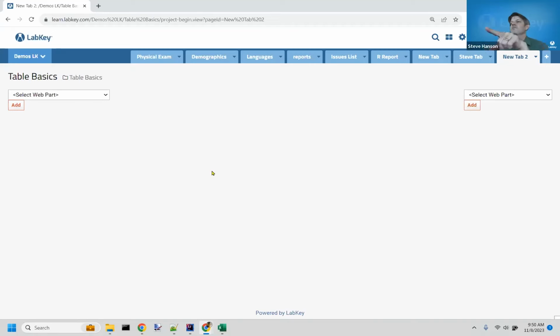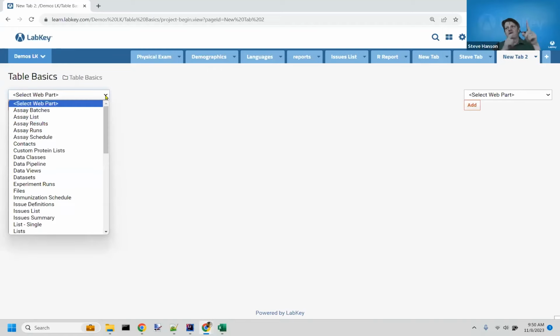Was there more to that question, Will? Could you say a little bit more? Yep. Please explain, how do you create those tabs pointing to a data set? We can link a web part to a tab, but how to link to a web page of the project, or as here, to a data set? I'm not quite sure on all that.